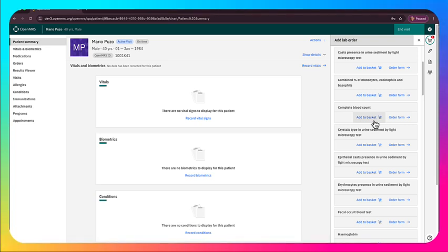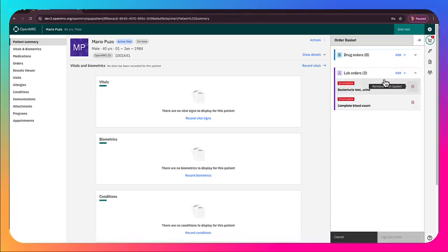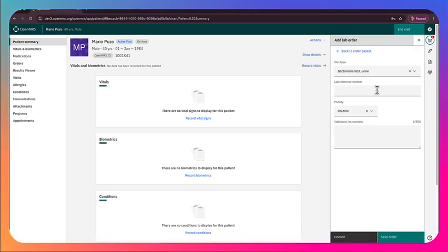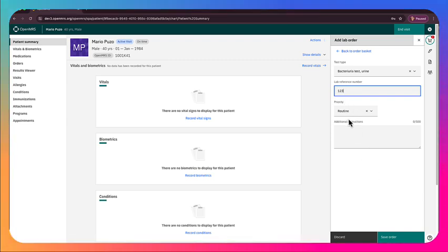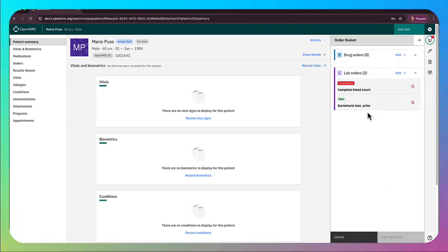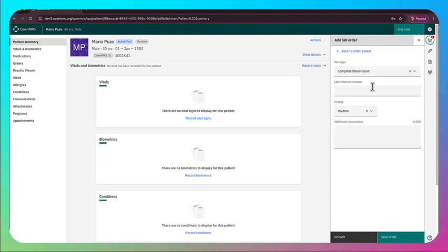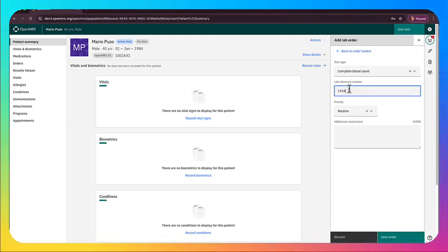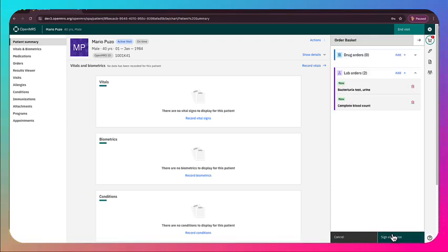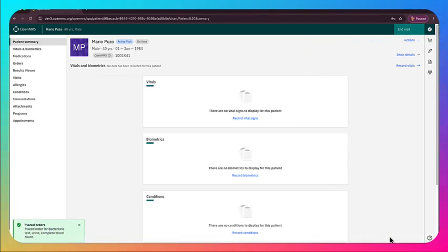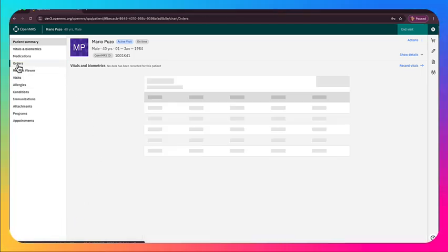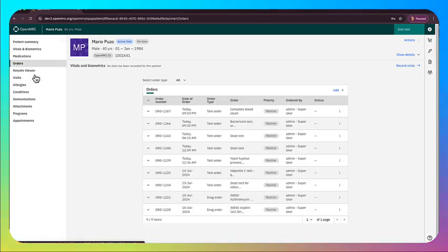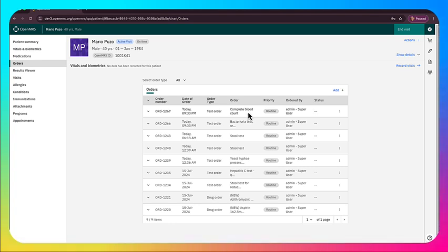We'll do a complete blood count, which is a whole panel of labs, and then this bacteria urea, which is just a single test. So we enter in the lab reference number for both of these, and this would normally be the number or label that's put onto the tubes as those samples go to the lab to help the lab know what order they belong to.